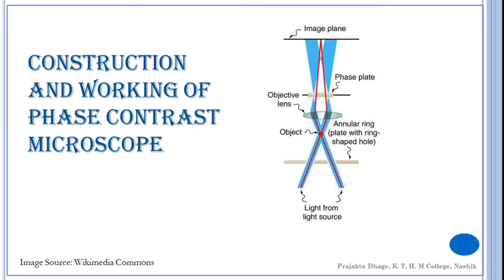If an object is placed under the objective, some light rays will be diffracted by it. These diffracted rays will spread out and fill the entire back lens of the objective and will overlap the central light rays. If the diaphragm is in the form of a circular aperture, as we generally use in regular illumination, the degree of overlap becomes much more, and then it becomes impossible to separate the two sets of light rays.